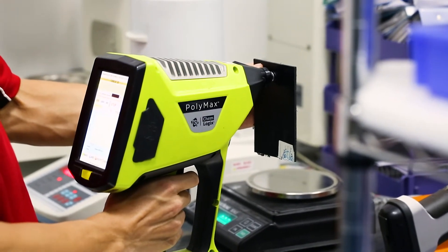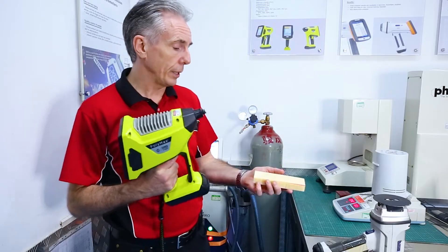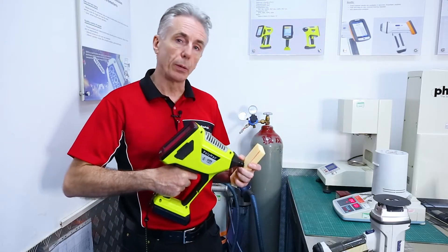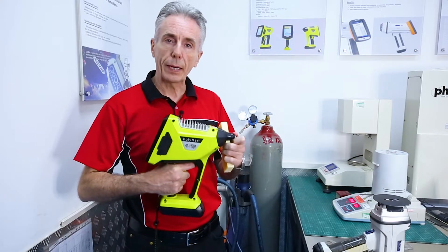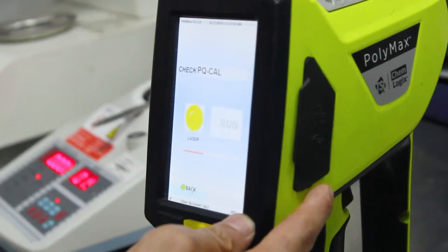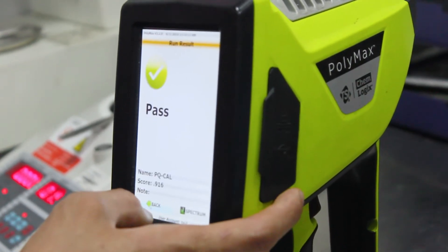On the plastics testing, it's Polymax. This is actually a sorting gun. You just pop it on the plastic, pull the trigger, and it will tell you what material category it's in. You can also calibrate the machine from a golden sample and then do a comparison between that golden sample and the material that you're testing.